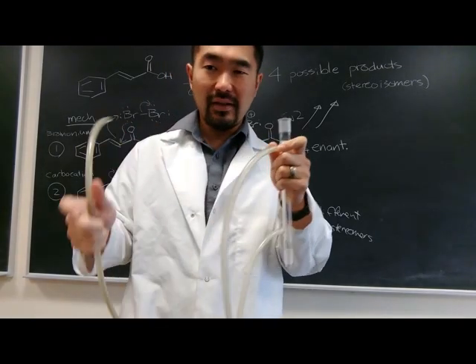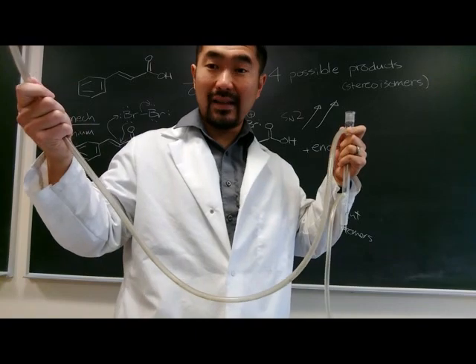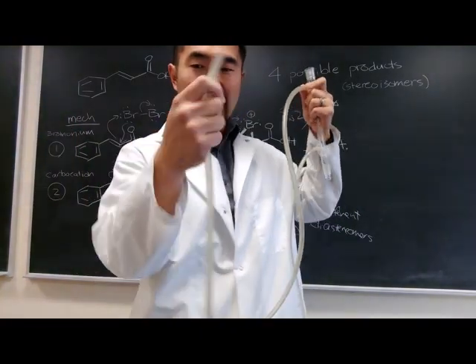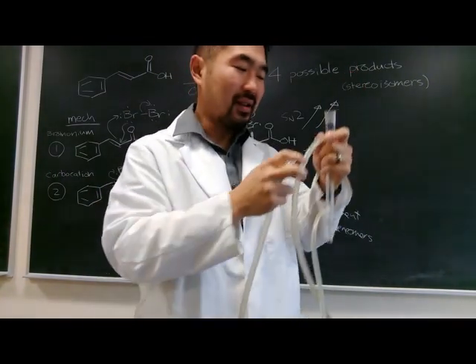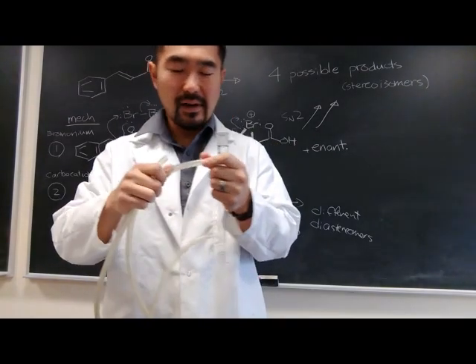Now, if you're sharing the fume hood, this top line should go as the inlet for the second person's condenser. So in other words, this will connect to the bottom of the second person's condenser. Okay, and then likewise the top goes to the waste.